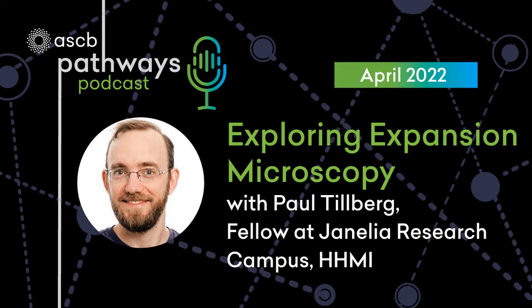Mm-hmm. Well, I really love the idea that these techniques focus more on the sample preparation, especially if you've got a rare or unusual sample and you don't want to chop it up a bunch of different times because you'll waste it. And it doesn't rely on the use of expensive microscopes. No offense to all of our microscope sellers out there. Or chemicals, by the way. The chemicals are also very cheap. Okay. Mm-hmm. Chemicals and the sample preparation.